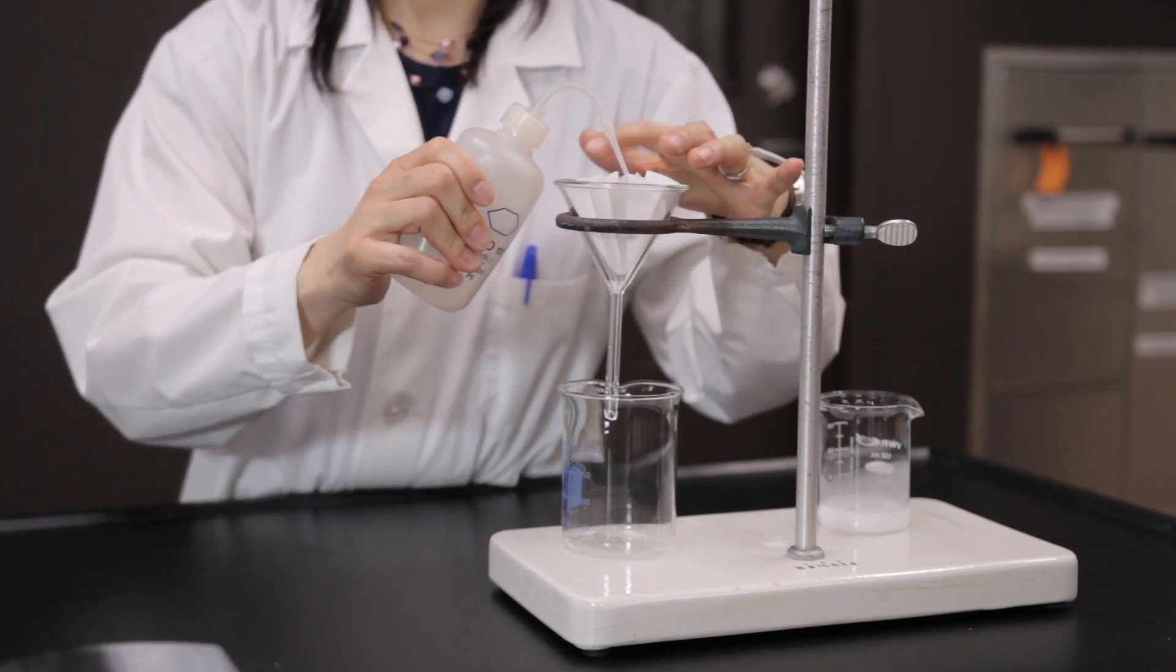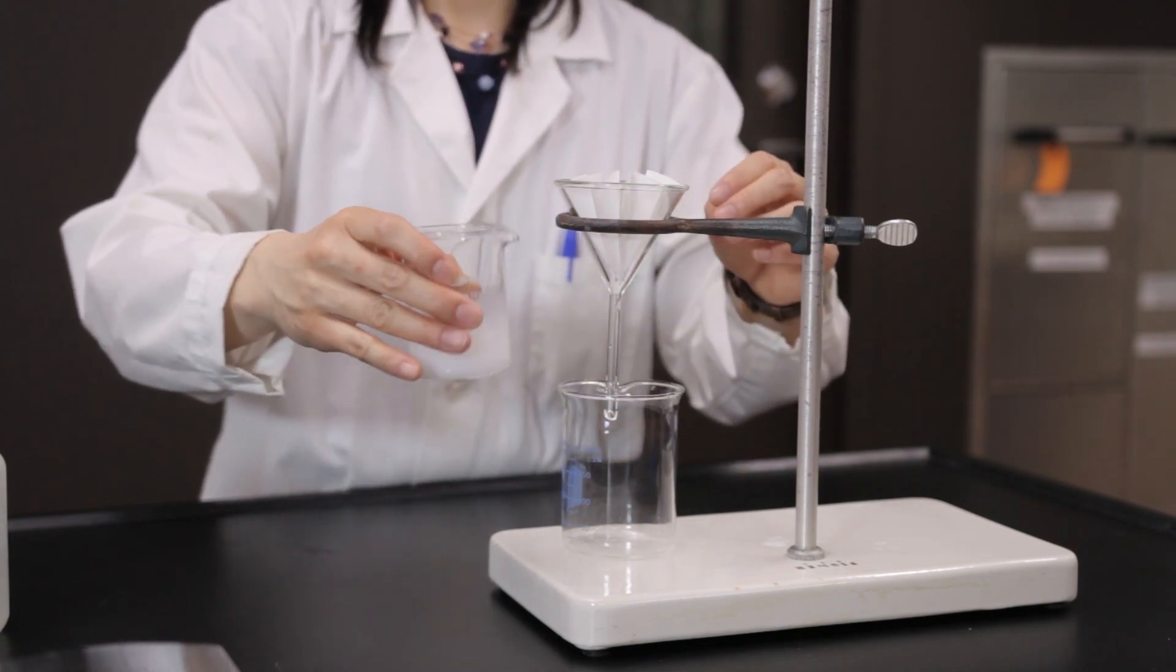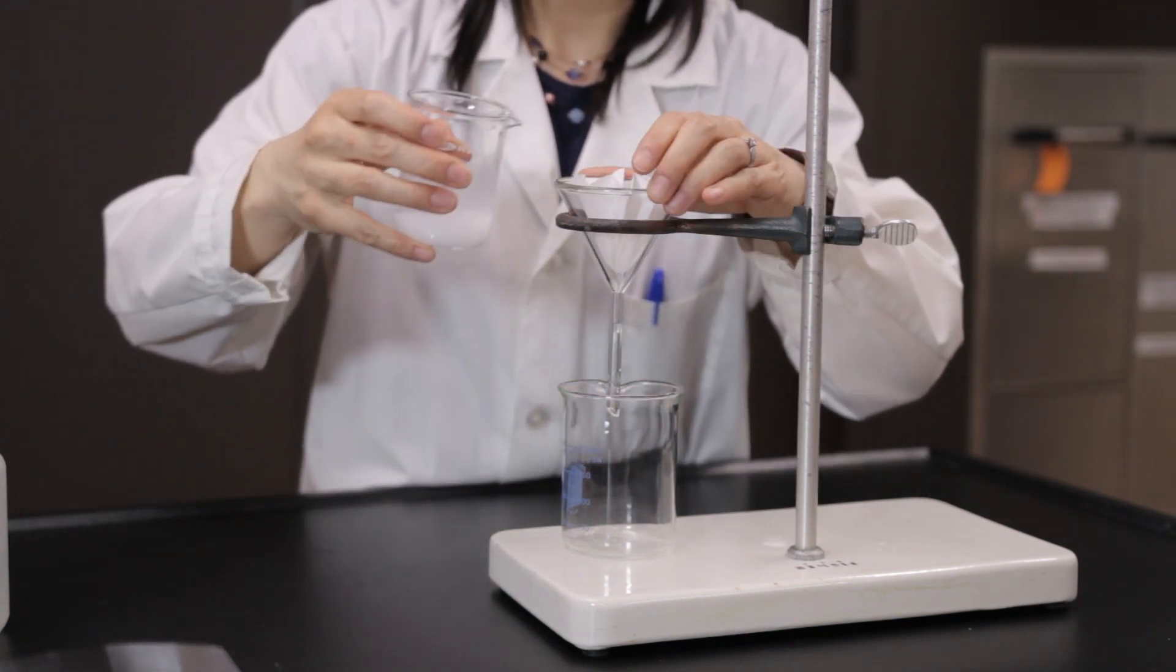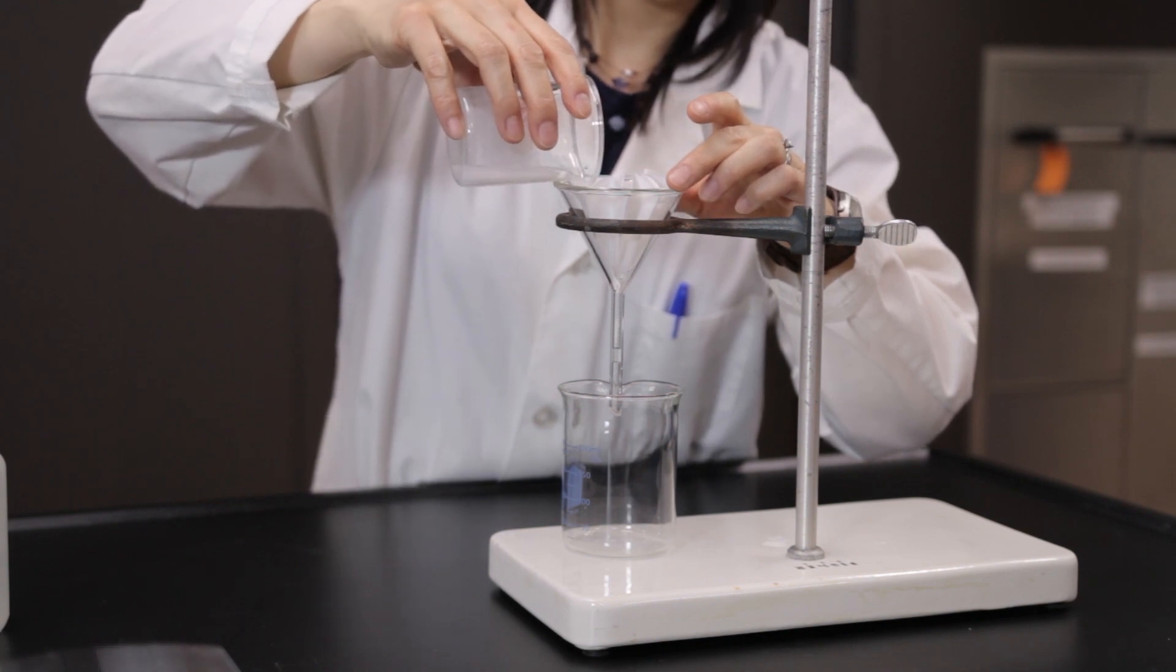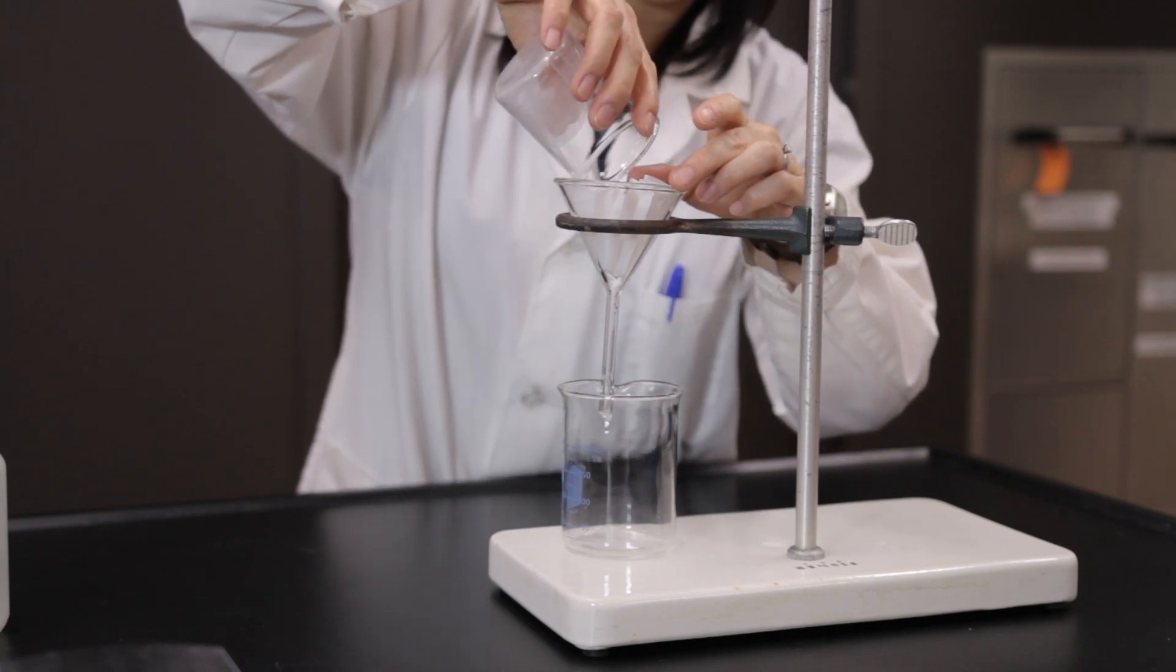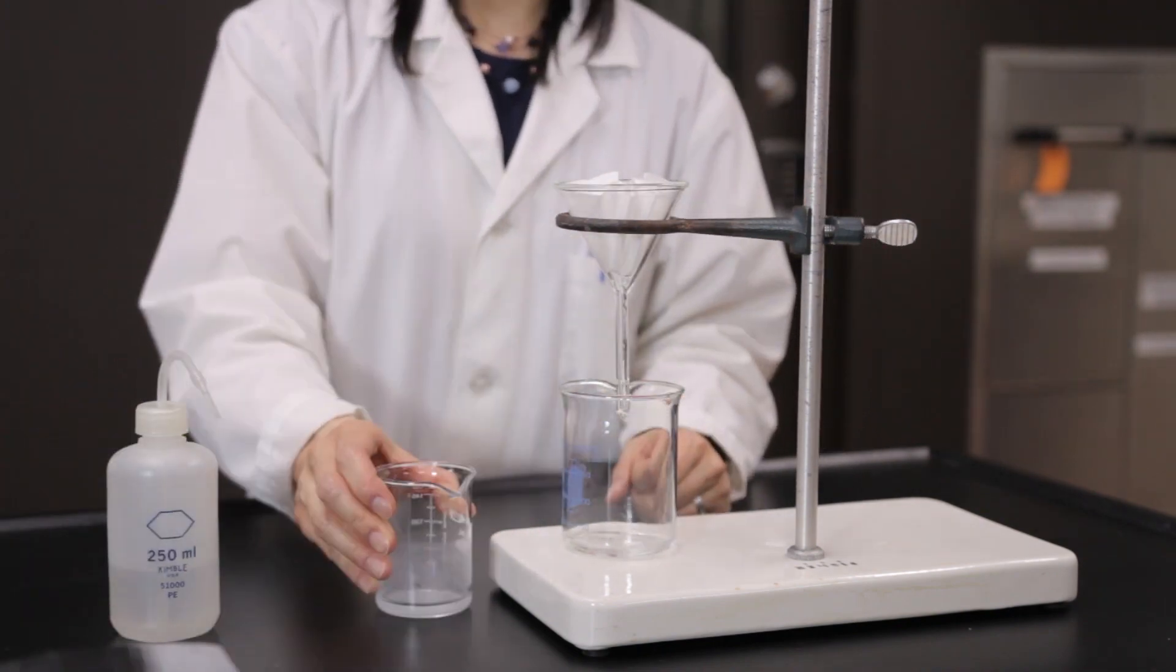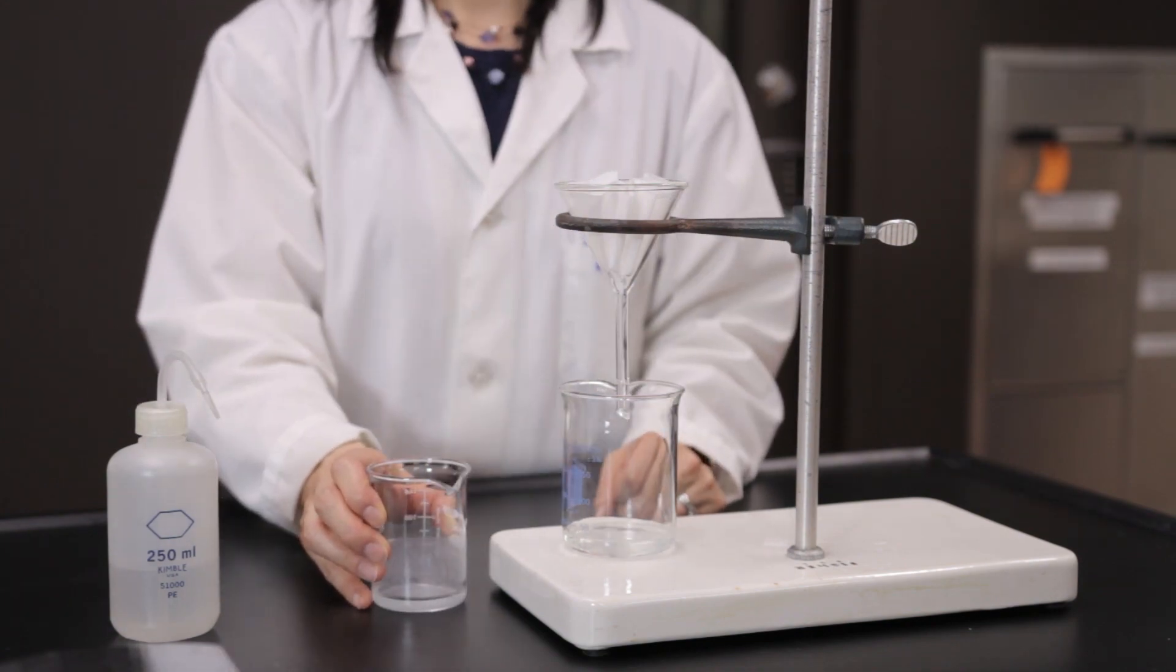Filter the solution to collect the precipitate. Rinse the precipitate a few times with small quantities of distilled water and then with small quantities of ethanol. Rinse the beaker a few times with distilled water to transfer as much of the product as possible into the filter paper.